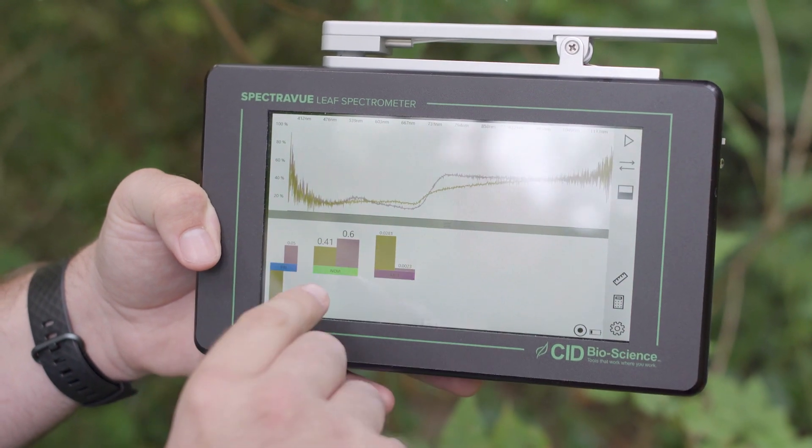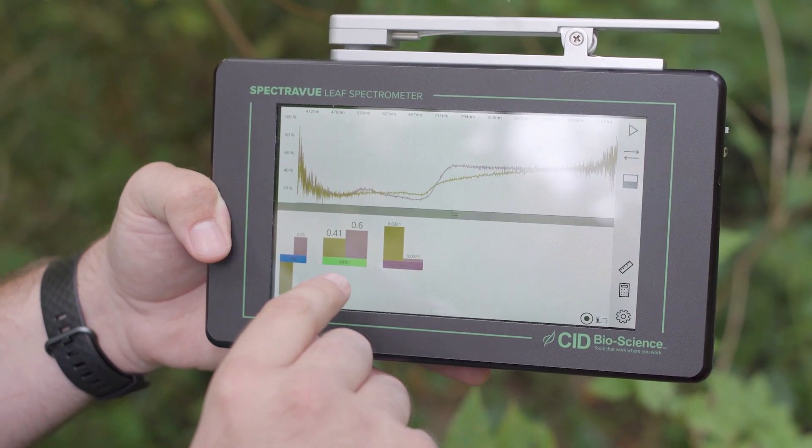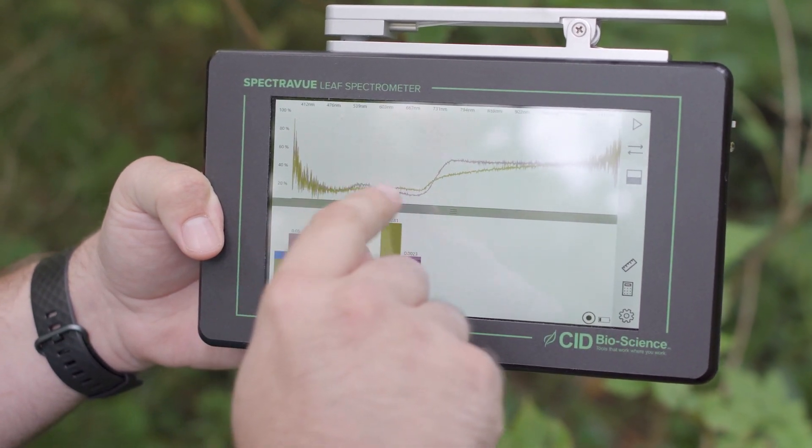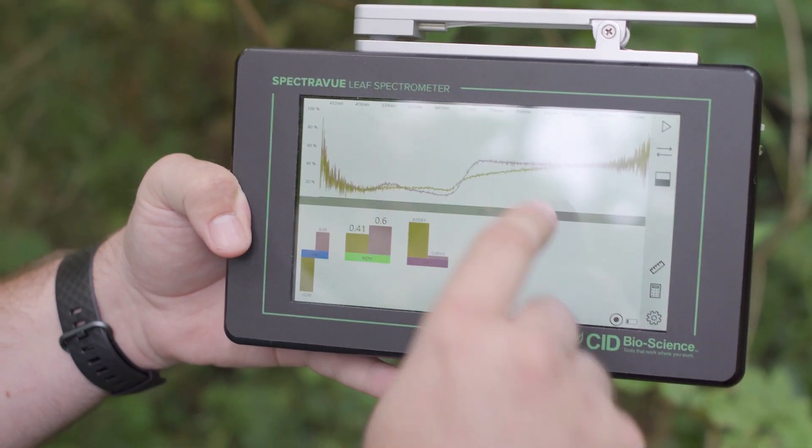So the first measurement we took was the healthy leaf, and that is represented by the purple bars down below, as well as the purple line up on the spectrograph above.